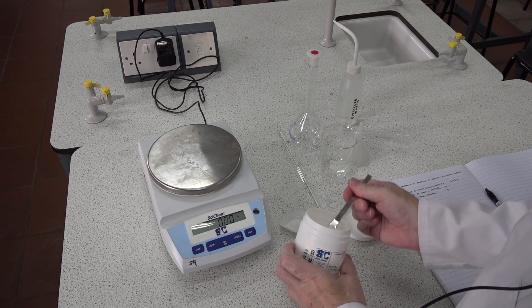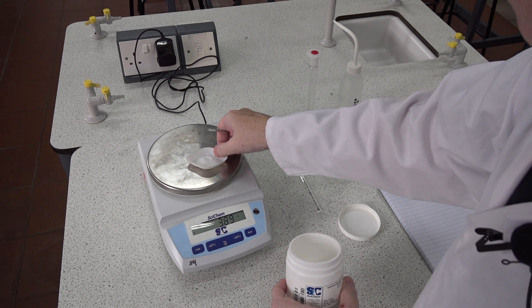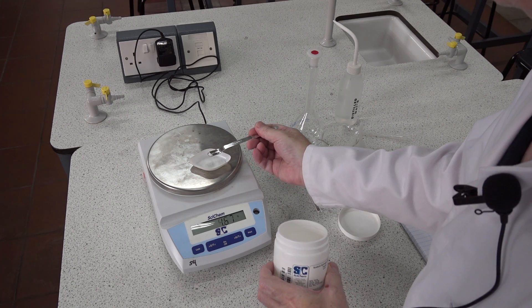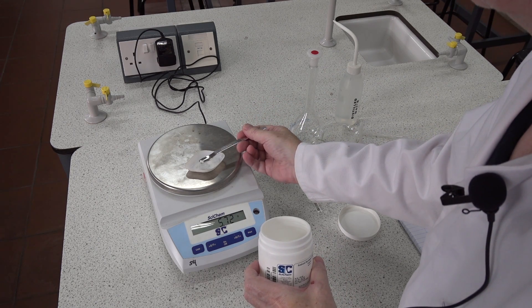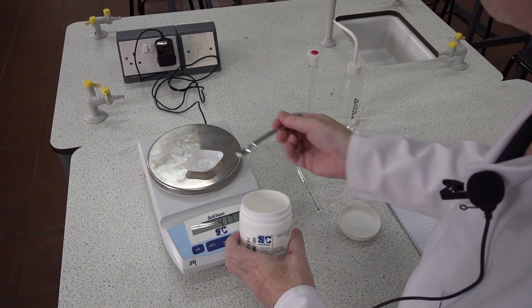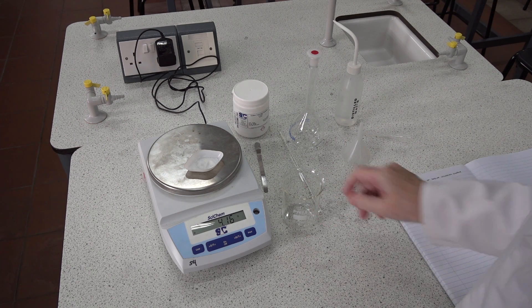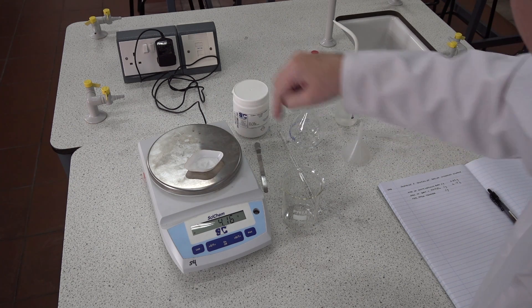We need about a gram more. We can just remove a tiny amount — 4.16, close enough. Next we record that in our lab book: 4.16 grams, mass of the boat plus the salt.